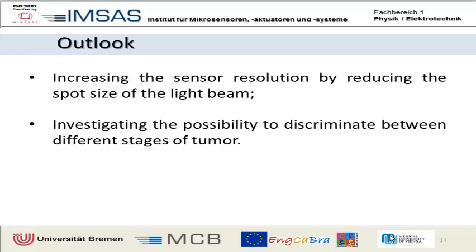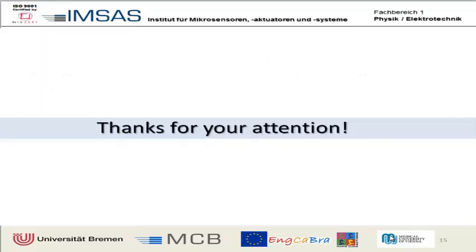And finally, we want to see if there's a correlation between the variation of the CH2 stretch ratio values within the melanoma samples and the stage of tumor. So, by applying our infrared sensors, maybe there is also the possibility to discriminate between different stages of tumor. We hope that it works.